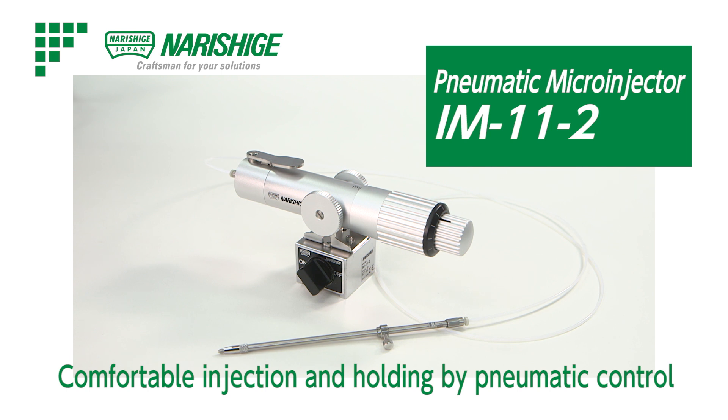Injection with Pneumatic Control. Pneumatic Microinjector IM-11-2.